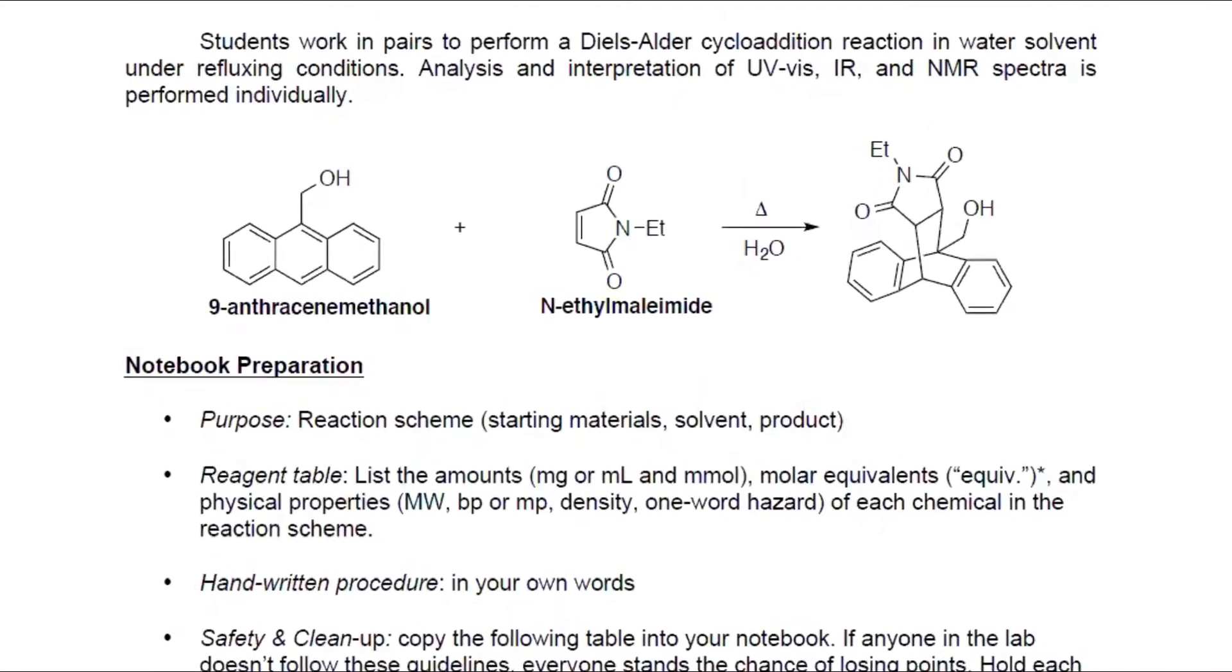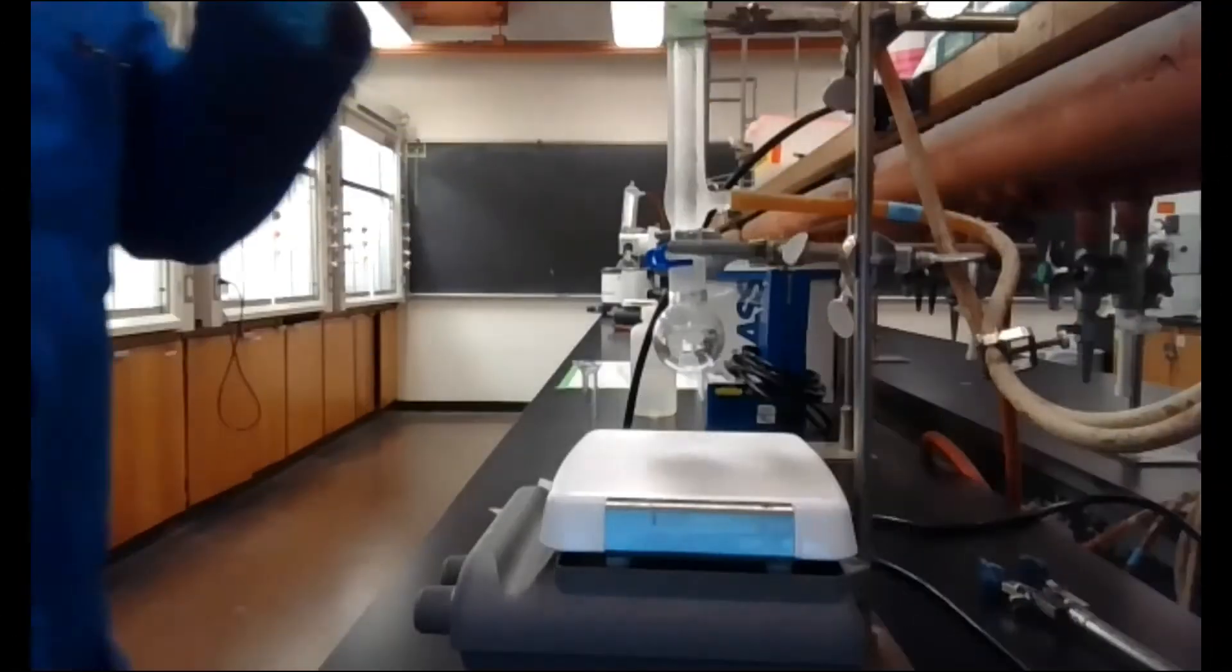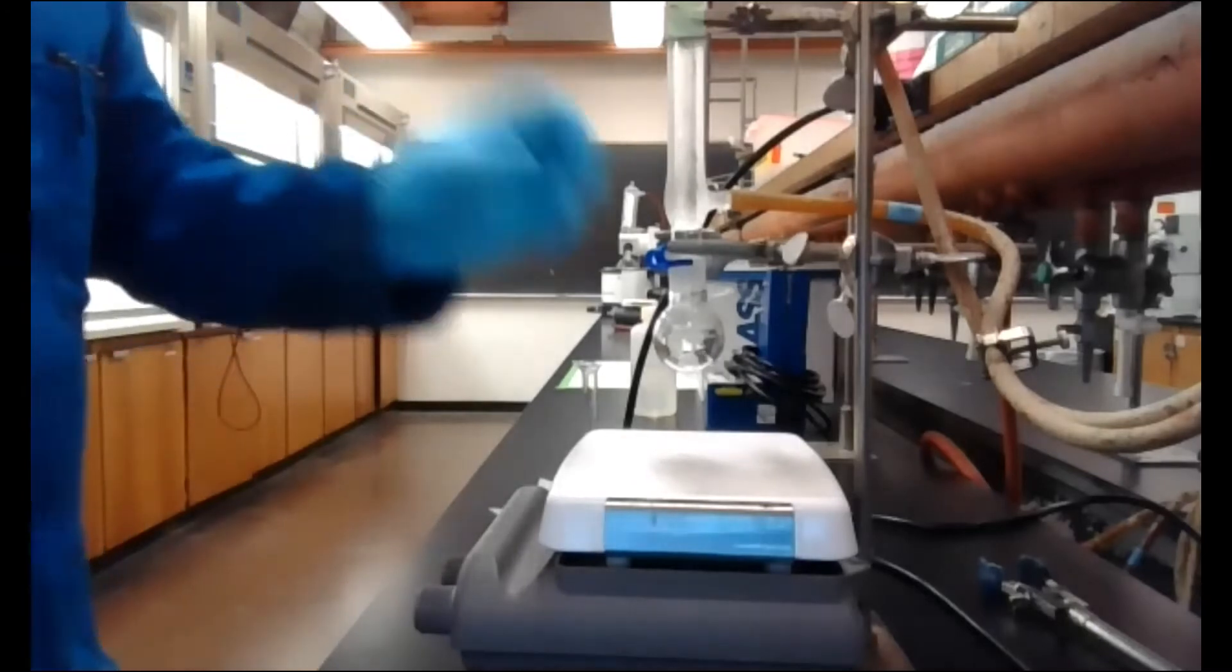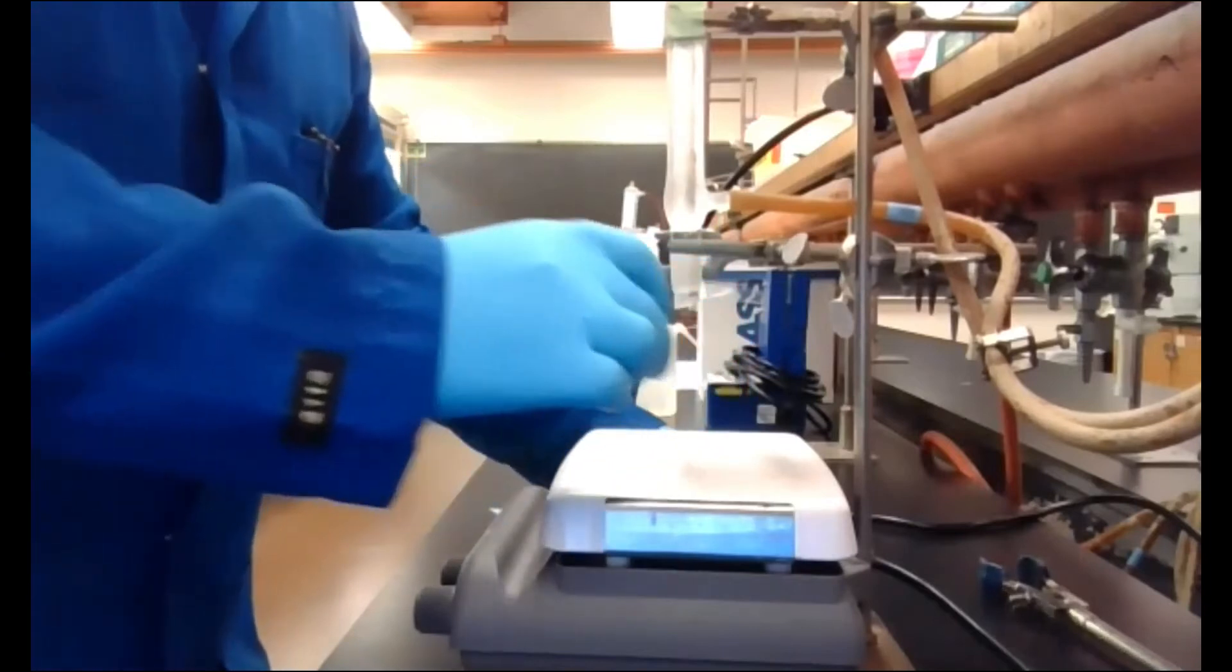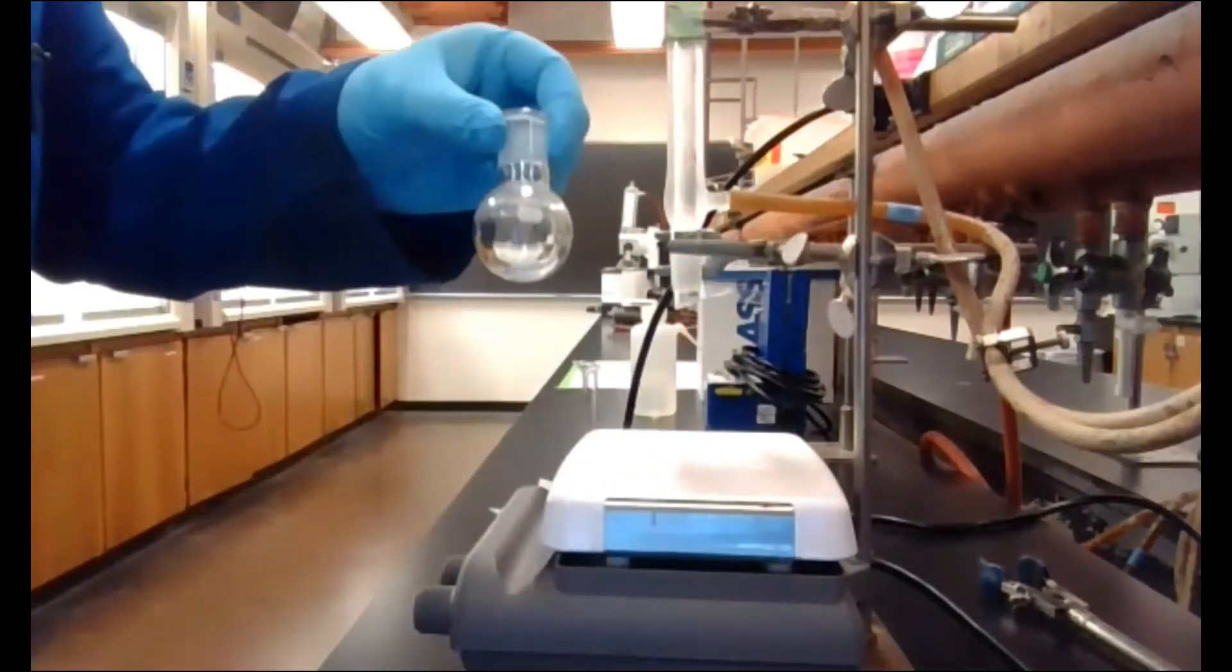Daniel, do you want to tell us a little bit more about what you've done? All right, so I have a reflux condenser hooked up to, in this case, a 25 ml round bottom. I didn't have a 15 ml available, so I'm going to use just a size bigger.